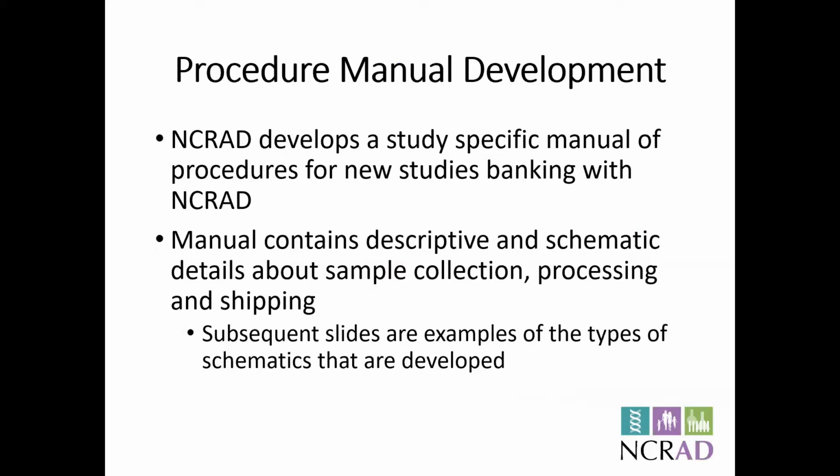So NCRAD develops a study-specific manual for the procedures for each study that's banking at NCRAD. The manual contains descriptive and schematic details about sample collection, processing, and shipping. And I'll show you in the subsequent slides some examples of the types of schematics that we develop.